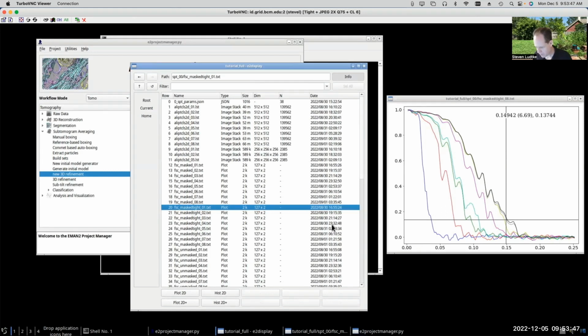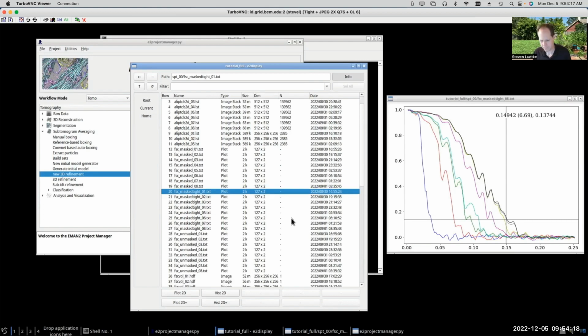That was not too much different in time, an hour and 45 minutes, something like that. The rotational alignment took quite a lot of time, so that would have been 6 a.m. till 1 a.m. the next day. So that rotational alignment step just took a tremendous amount of time. And then the defocus alignment didn't take too long. That took a couple of hours.